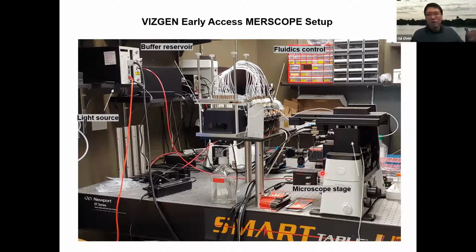It's basically totally open, and then you have 2 parts. One is basically the imaging part. The sample is right here. And then you have the pump, the fluid part, where you pump different probes in there. And as I said, there's a serial hybridization process and washing, and that comes up here. So it's quite simple. And right now they already commercialized the instrument, and it's pretty much like this, but they make it more engineered, nicer or robust. I think the technology is pretty much the same.